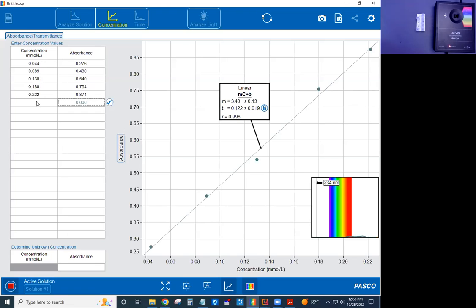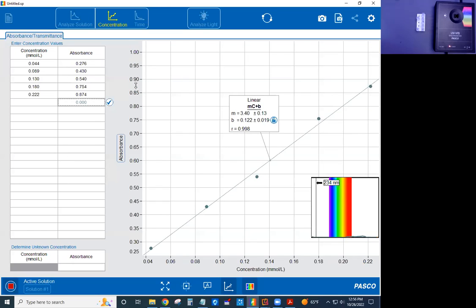If I started high and went low, and I went from solution D through A, or actually, no, sorry, I misspoke. Because the relationship between absorbance and concentration is direct, you will see that when you are within that range between 0.2 and below the absorbance of 1, as long as you've got known concentrations, your absorbance should be showing a direct relationship indicated by a good linear fit. Your R is very close to 1.